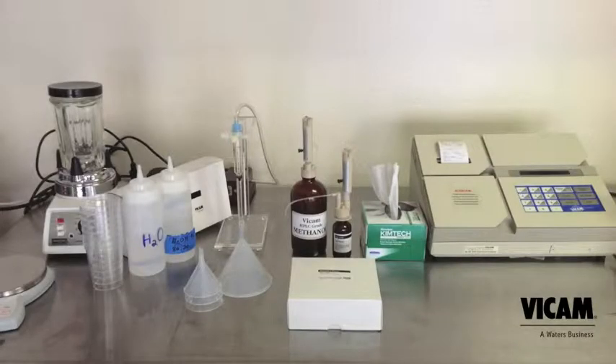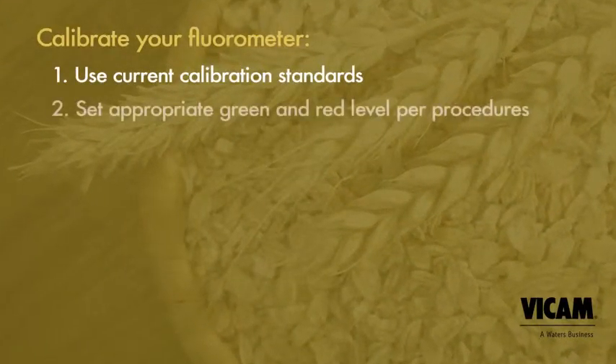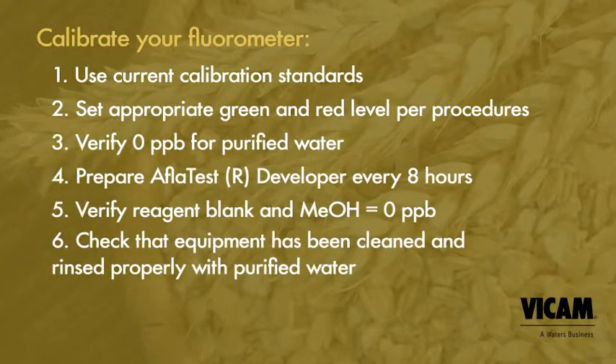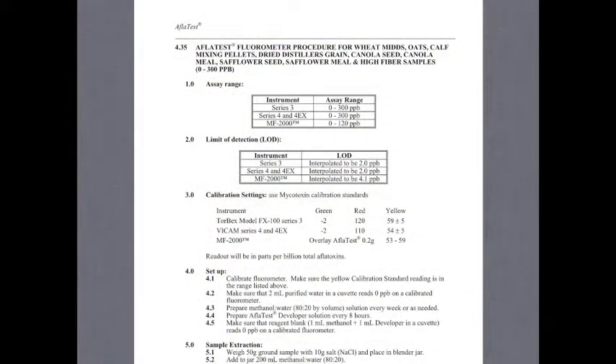Prepare your lab area, calibrate your fluorometer, and prepare your 80-20 mix of methanol and water. Prepare your AflaTest developer per the instructions on the bottle. Developer is good for 8 hours. Be sure that your fluorometer has been calibrated to the proper red and green calibration settings and tested with the yellow standard.